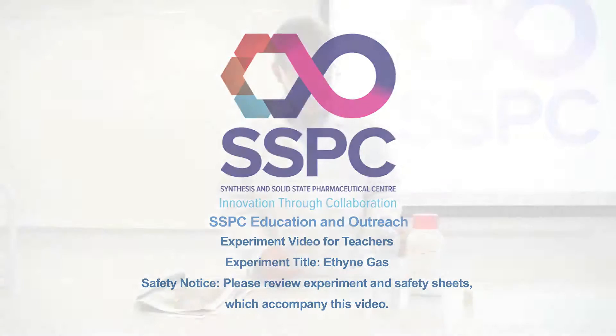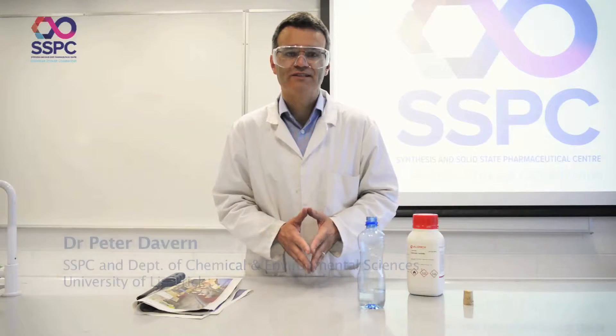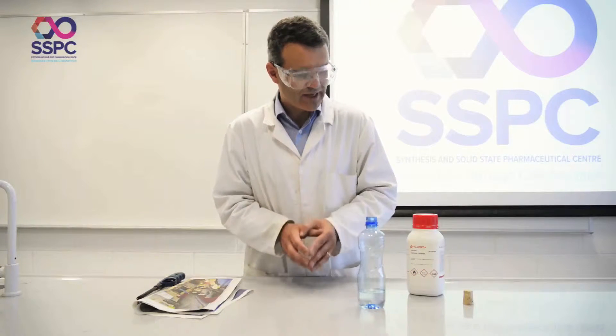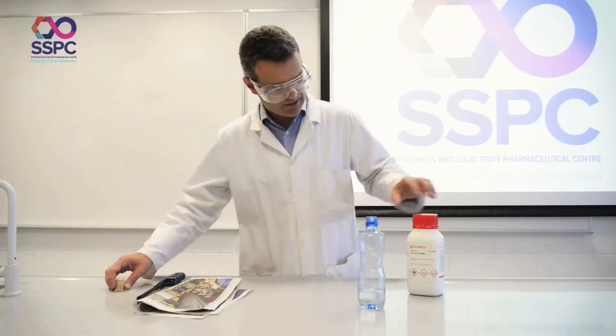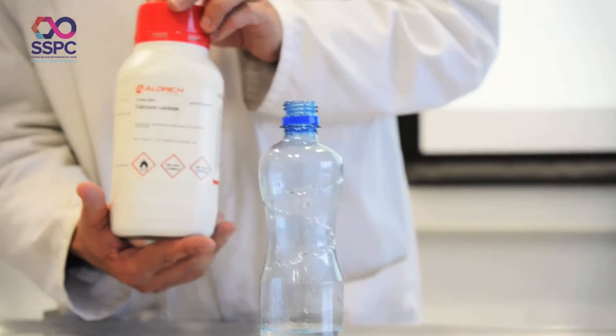This experiment is where we're going to generate some acetylene gas, or ethyne gas, and just explode it — just light it and explode it. A very handy way to make acetylene gas is to use calcium carbide, CaC₂.